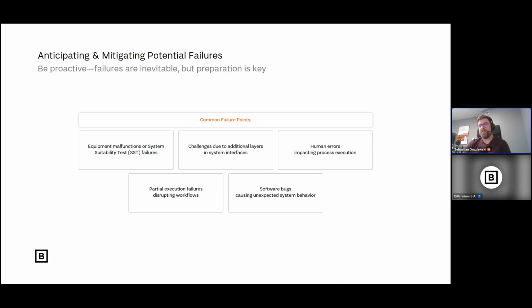We need to be prepared for all this, because the easy part is, let's say, the happy path during the workflow execution. And sometimes these unhappy paths happen, and we need to have processes ready to combat these problems. And also, what happens is that your core software may have some bugs which will affect your daily work in different ways. So workarounds and solutions are really welcome and need to be described in some kind of a structured way.